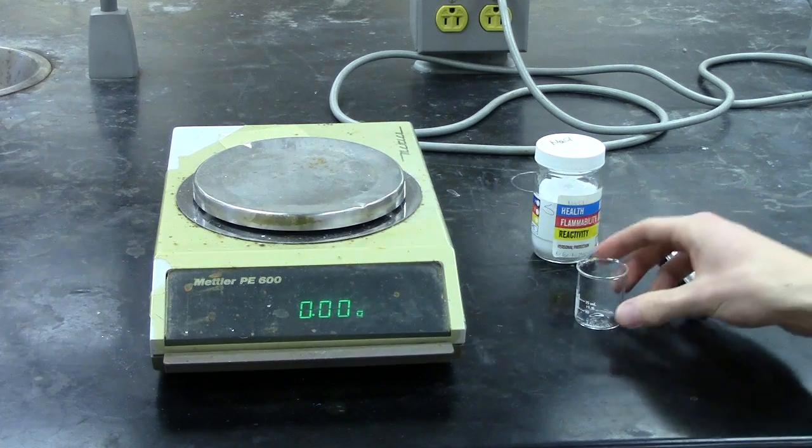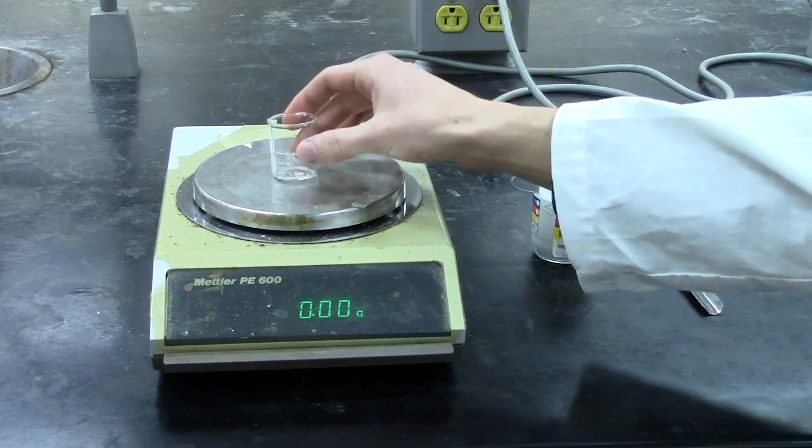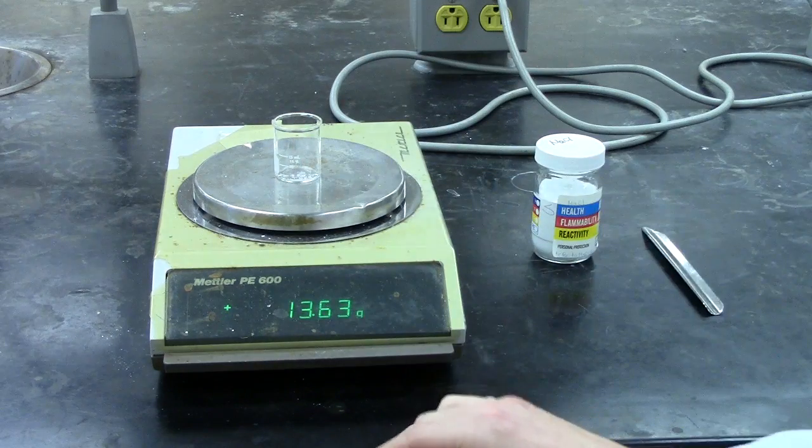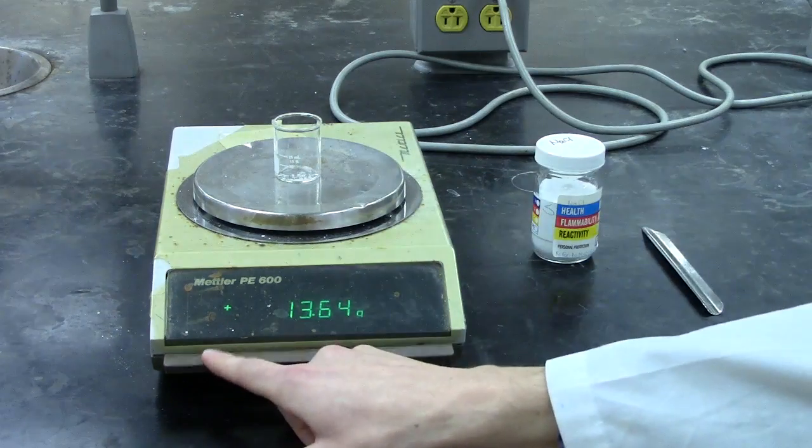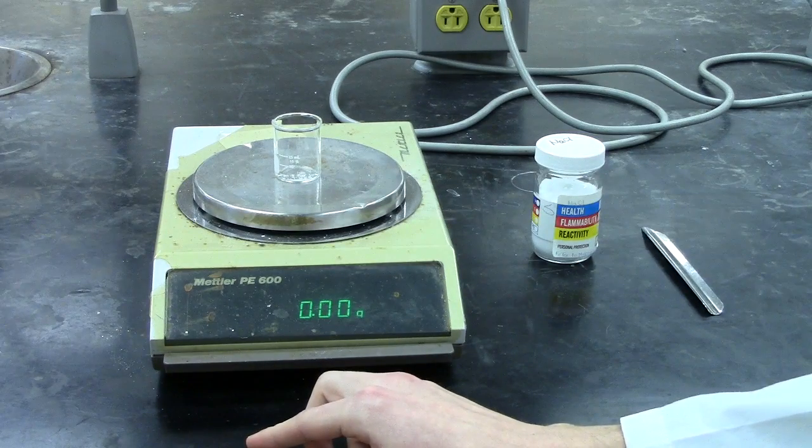Once you have your mass come up and if you are looking to measure in a particular vessel, you load your vessel and then press the tare button which brings you back to zero grams.